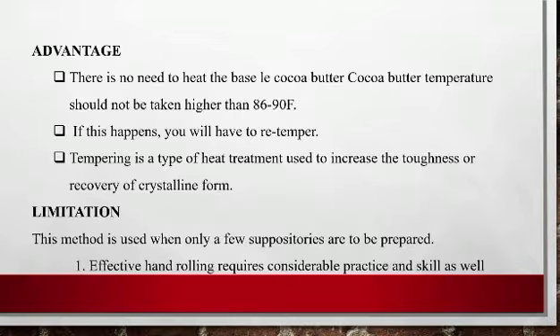Next is the advantage of this method. First, there is no need to heat the base like cocoa butter. The cocoa butter melts below 35 degrees Celsius, so the temperature should not be higher than 86 to 90 degrees Fahrenheit. If this happens, you will have to retemper it.